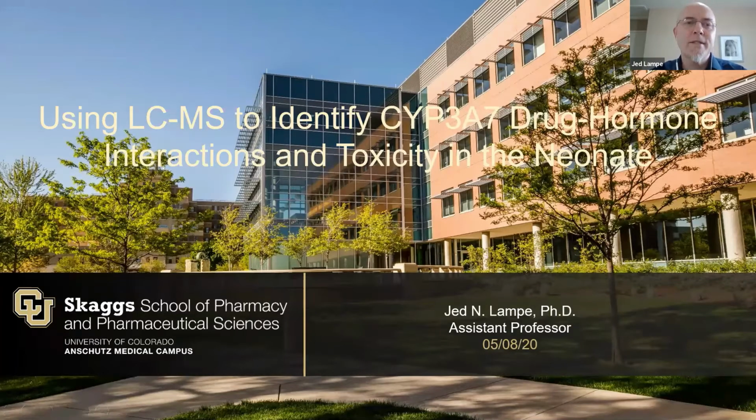So today I'm going to talk to you about using LC-MS to identify CYP3A7 drug-hormone interactions, and I modified the title a little bit because I'm also going to talk about how they affect toxicity of drugs in the neonate. So my lab is a drug metabolism pharmacokinetics lab. So we're doing a lot of small molecule metabolite identification and quantification.